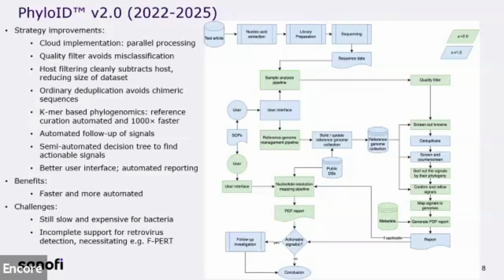And also, retroviruses. There's other tests for retroviruses, so we're covered there from a viral safety standpoint, but we would like to be better at detecting retroviruses. So that was, again, challenges at the bottom or solutions on the top of the next one.